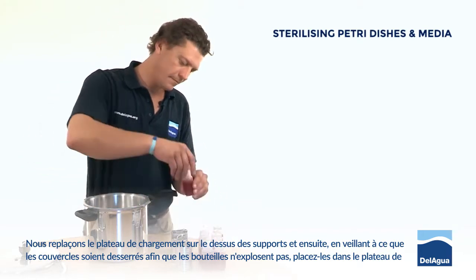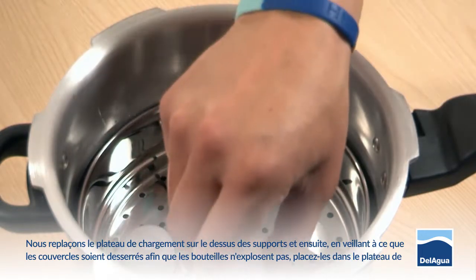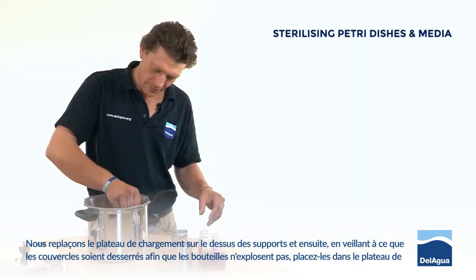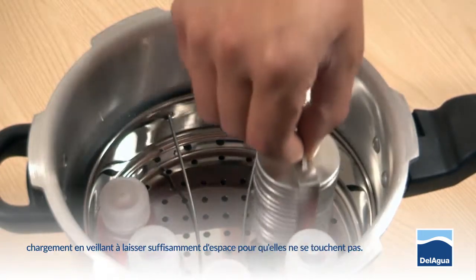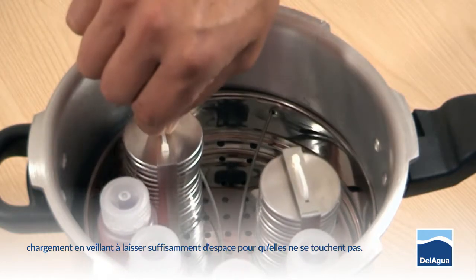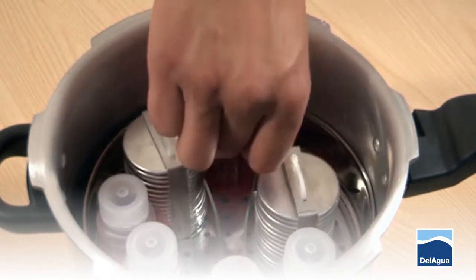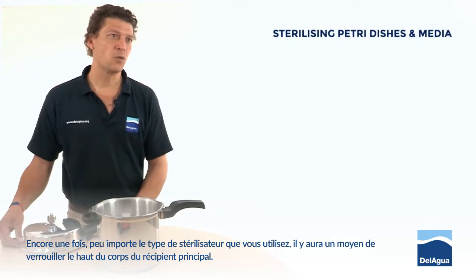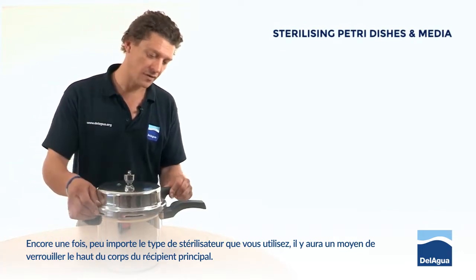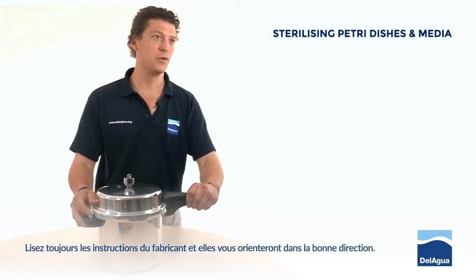And then carefully, ensuring that the lids are loose so the bottles don't explode, place them into the load tray, ensuring that there's sufficient space for them not to be touching. Again, it doesn't matter what type of steriliser you're using, there is going to be a way to lock the top to the body of the main vessel. Always read the manufacturer's instructions and they'll point you in the right direction.